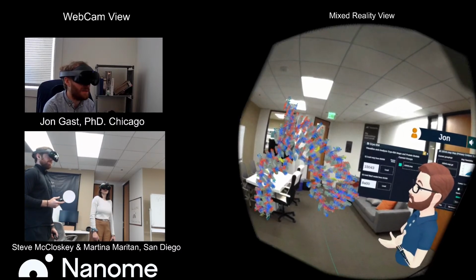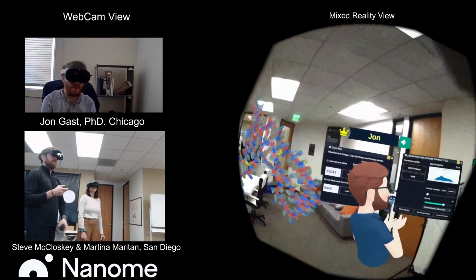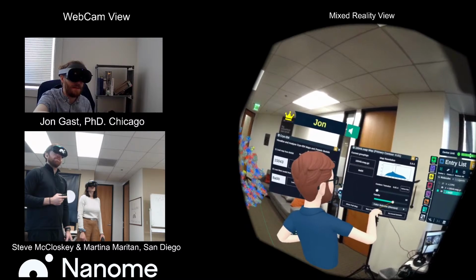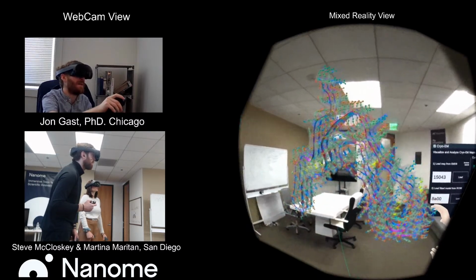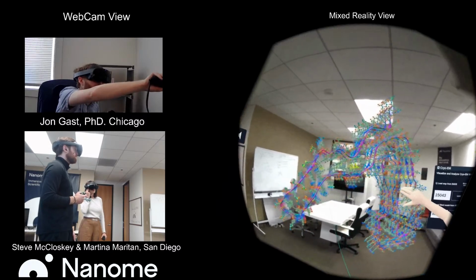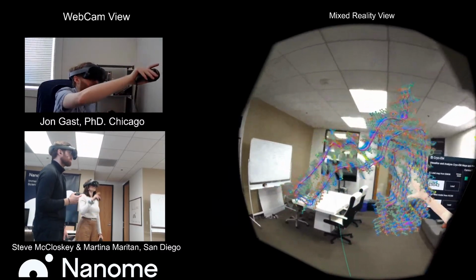Well, let's keep on looking at some other views of it. So, right, please, John, take it away. Yeah, we've got a number of other options here in our cryo-EM plugin. So one that I'm just going to show pretty quickly is I'm just going to try decreasing the opacity. So with the opacity a little bit higher, we're going to be able to see more about the fit inside of it. But even lowering it, we'll be able to see a little bit more articulation of the atoms and bonds that are building all this up, and maybe even get an easier view of some of this.